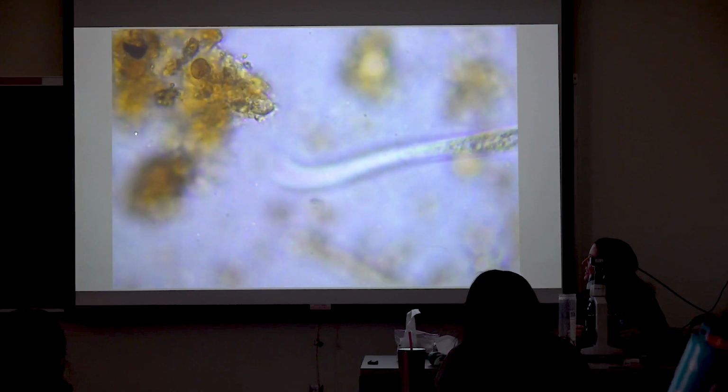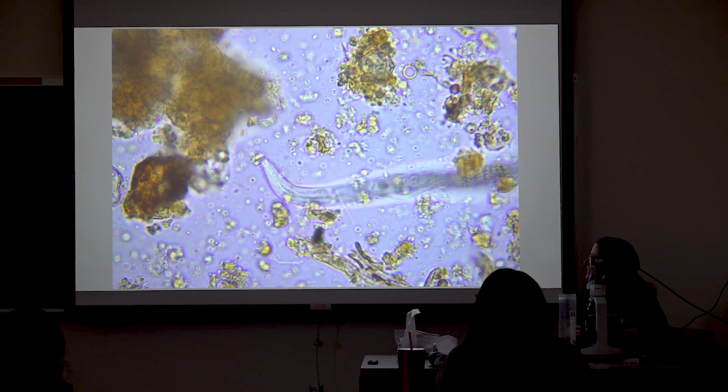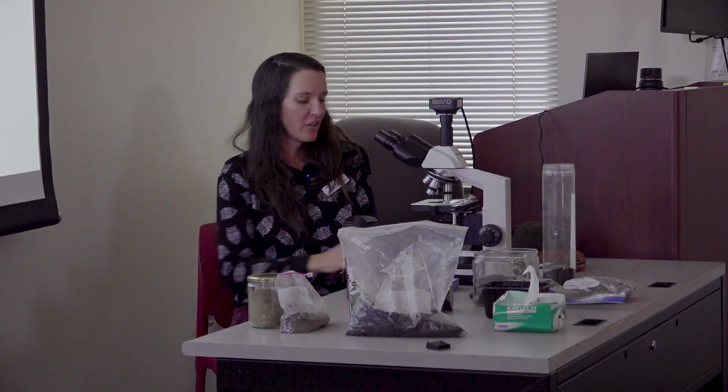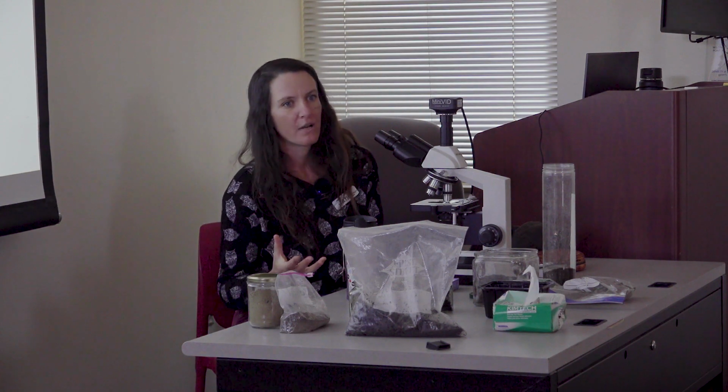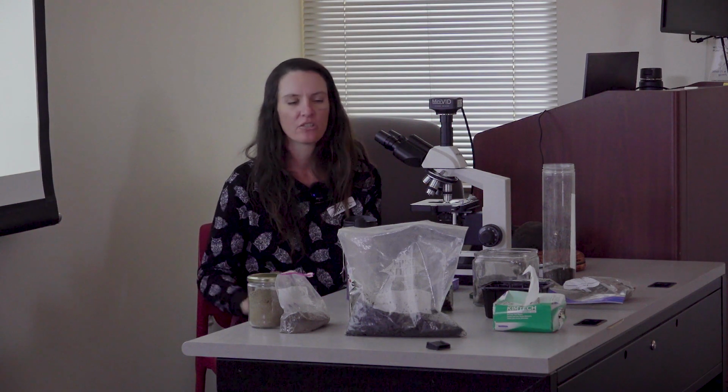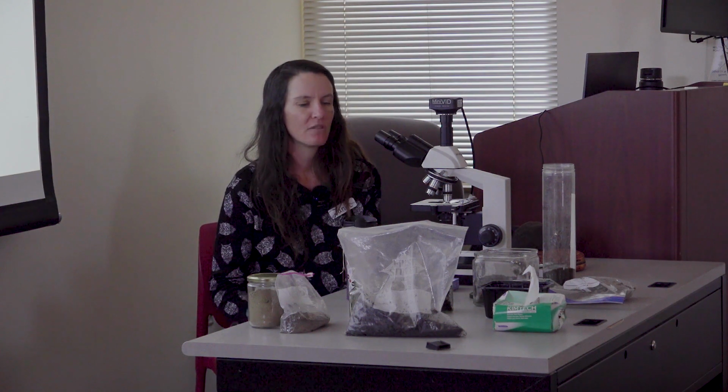So with microscopy, we are just figuring out what kind of microorganisms exist in our soil. Yeah, so the things that I would put on a report if I were doing this for somebody is we have all of the different functional groups. I need to see a certain number of organisms from each of those groups that I mentioned. So a certain number of bacteria, a certain number of protozoa, a certain number of nematodes for you to essentially pass this test and have a healthy enough environment that you are cycling nutrients at a rate that will support plants if you put your compost into the soil.